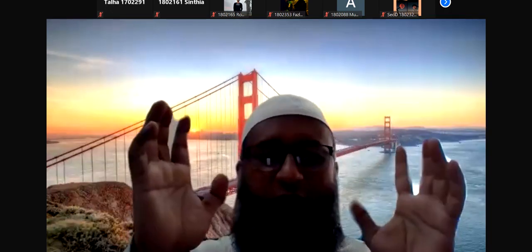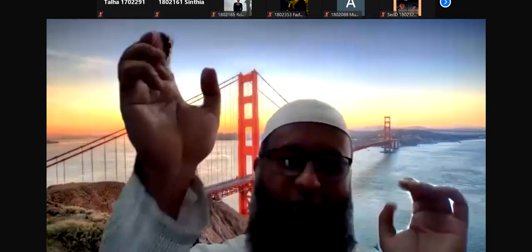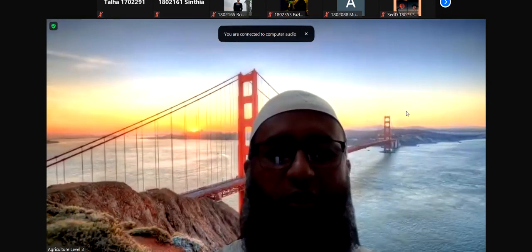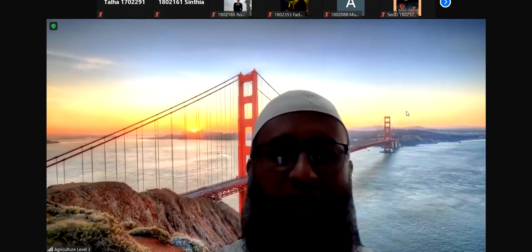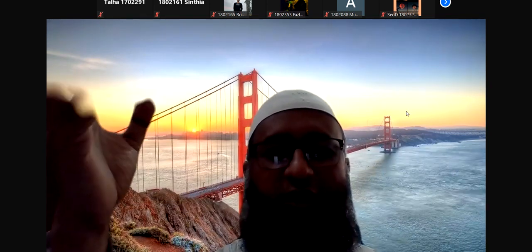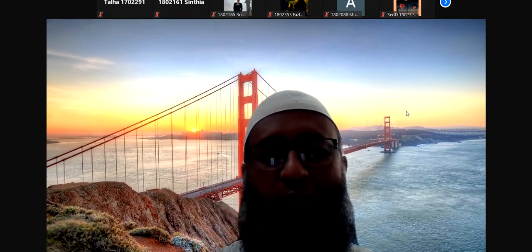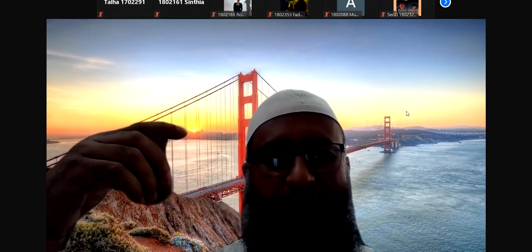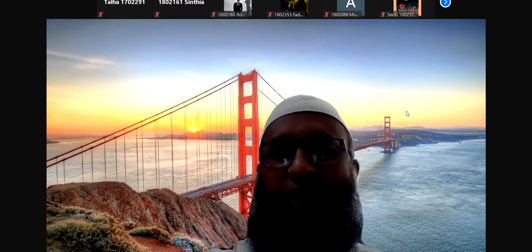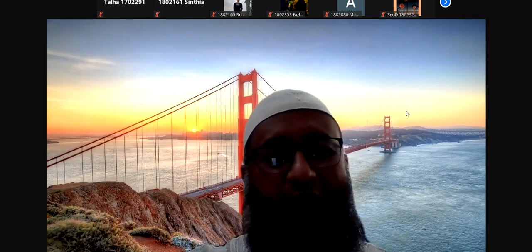So you are measuring soil moisture in Naogaon. Clay soil has high water holding capacity, sandy soil has less water holding capacity. So at the same time, you can also determine the texture of the soil you collected. So you get the texture data too. So you are getting all these data together. Then it's a kind of complete story.